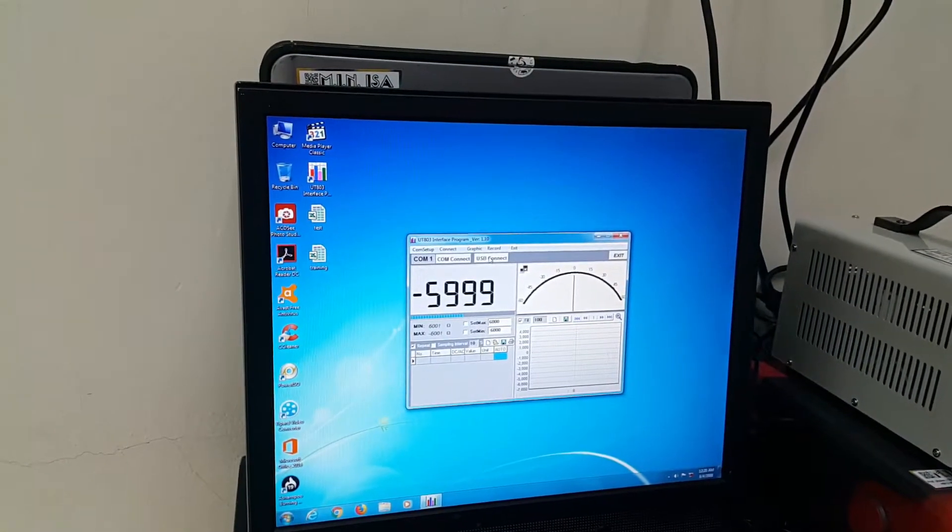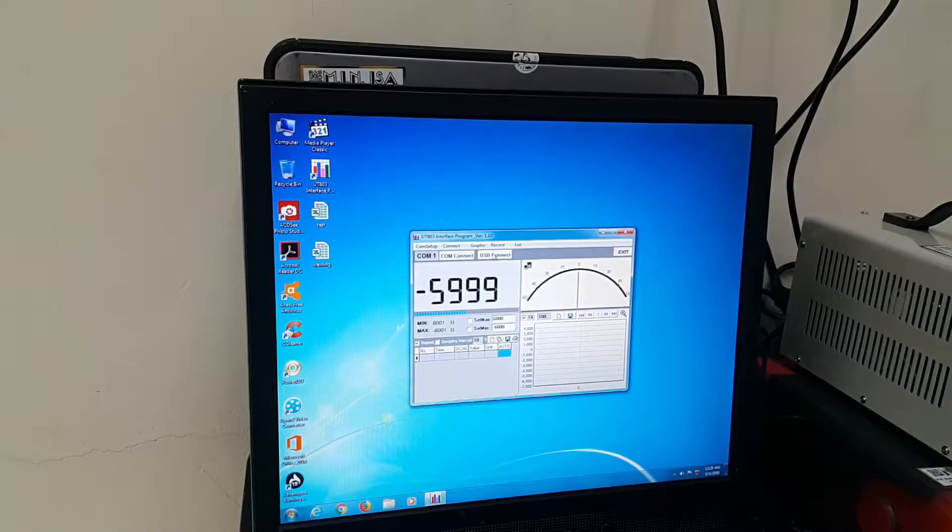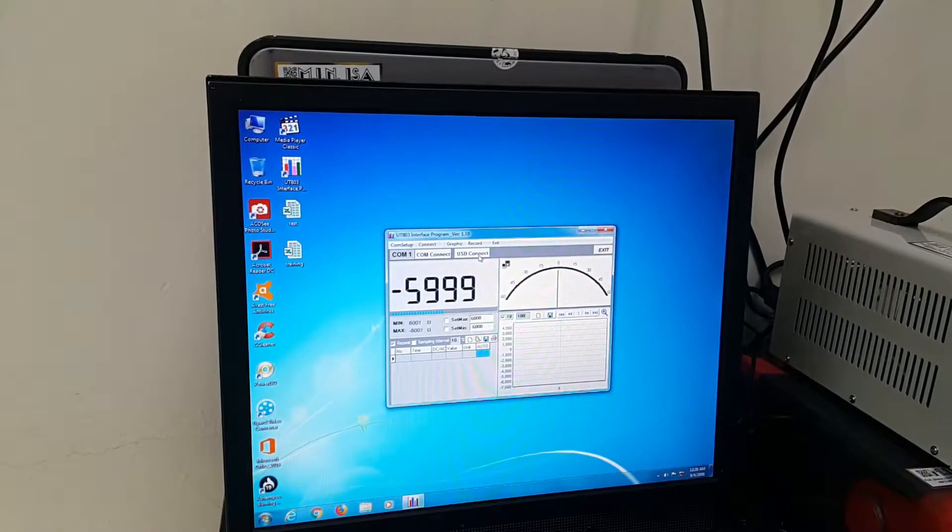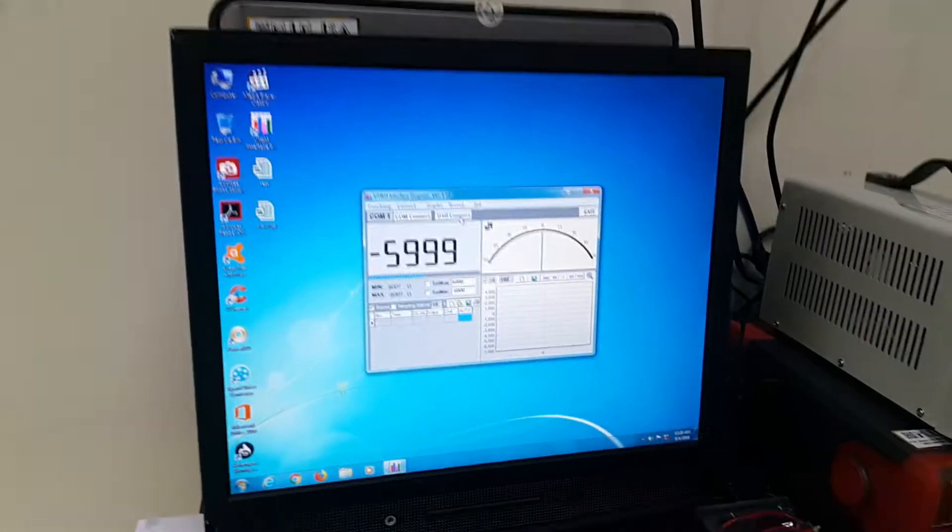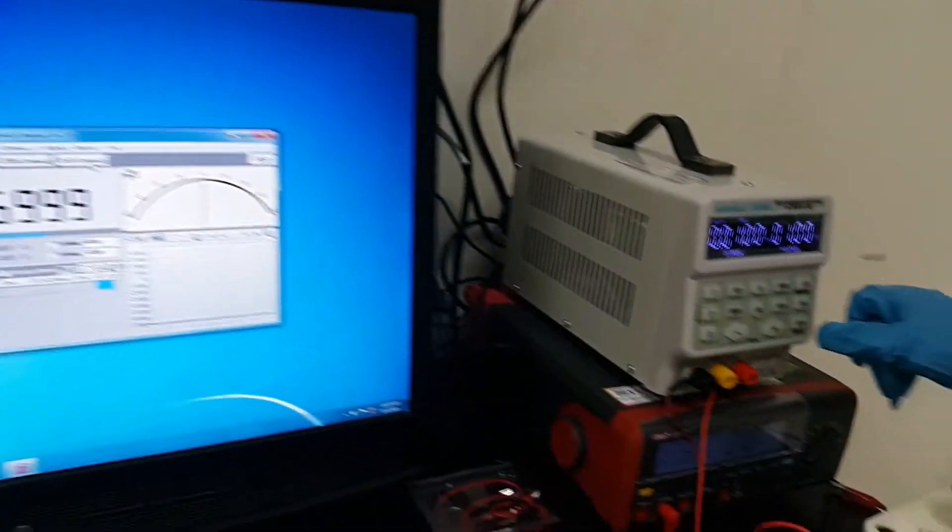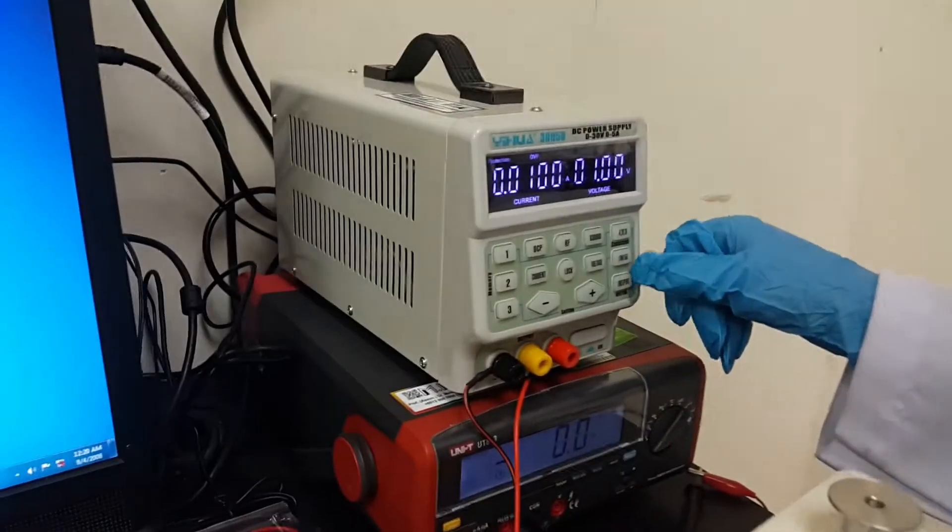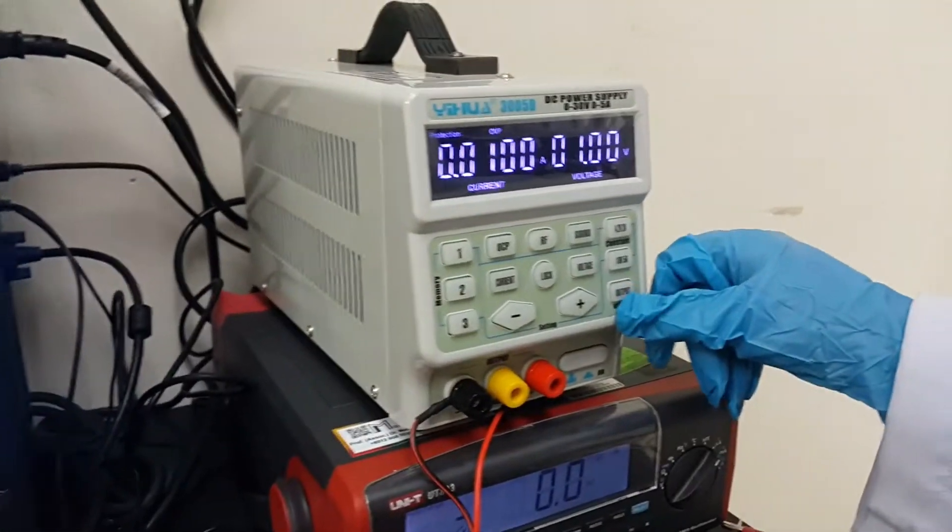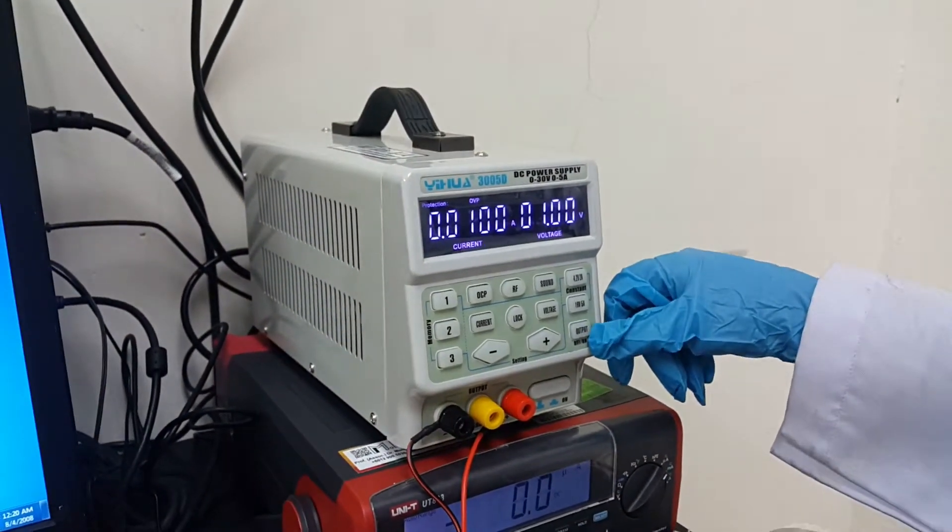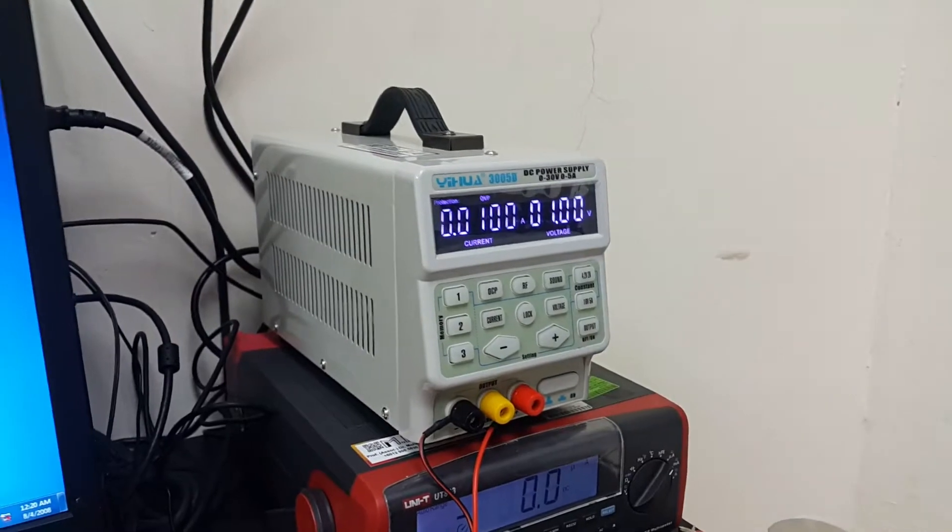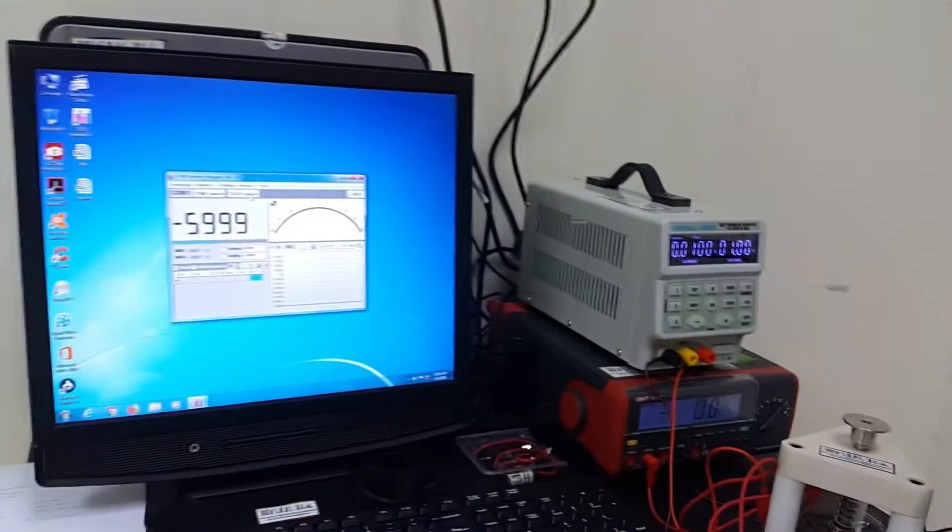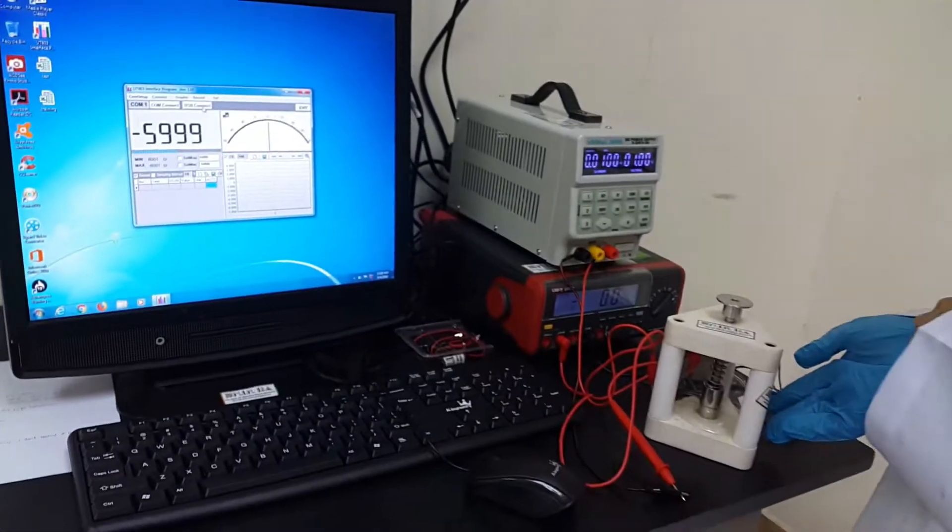Okay, and start to record time. Before that, we have to push this output button. After we press the output button, we start to record our time and let it run.